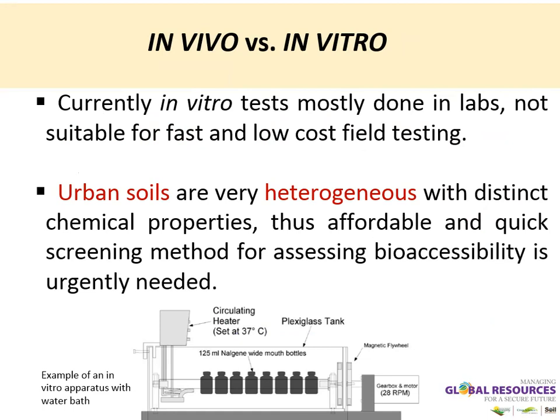In vitro tests also have their negative sides, and it's usually time-consuming. It takes a few days to perform the test. It's not very cheap because you need to get an ICP-MS running and get some chemicals. So urban soils are extremely heterogeneous, and it's extremely important to have so many tests done on them in various parts of the city, and it can be very pricey to do this kind of in vitro test. That's why we are trying to come up with a test that we can perform with the XRF, which is a very affordable and quick screening test.